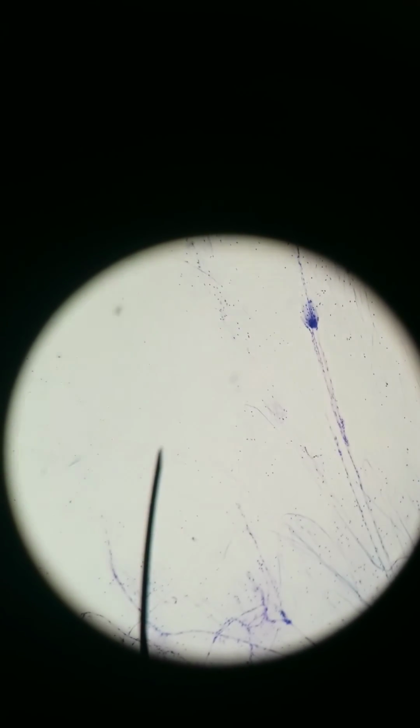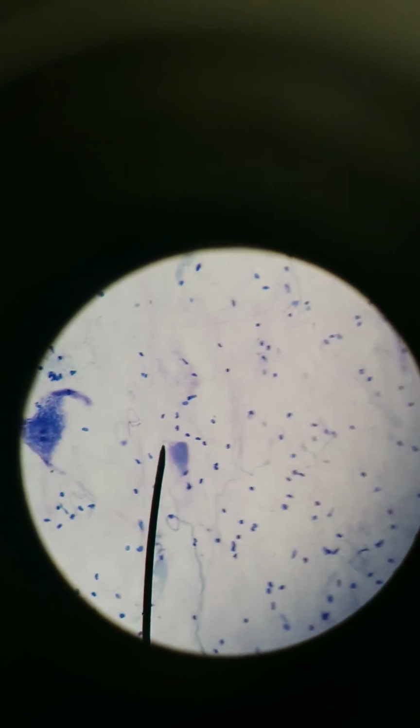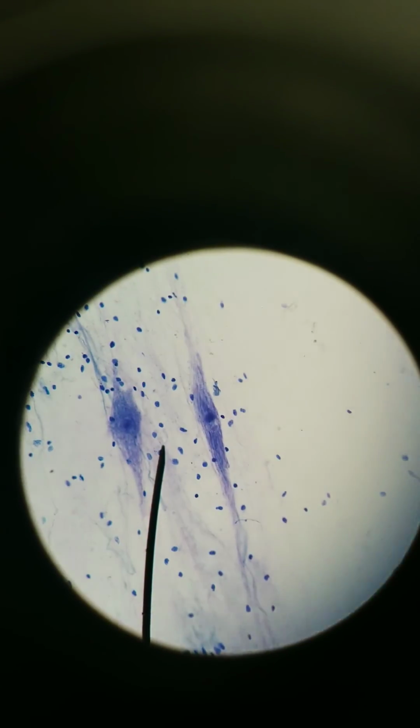I see cell bodies here. They're just not very clear. They're kind of overlapped. I'm trying to find a nice clear one. And that's where we were. Okay, here we go. Going back to 400x. Great. And you can see a bunch of cell bodies here.